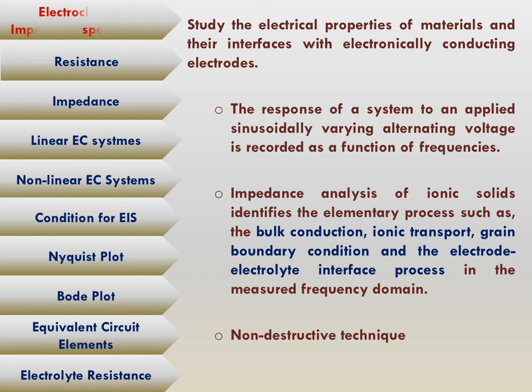EIS is a non-destructive technique, meaning it will not change the voltage or current in any sample. The sample can be used in other measurements again.